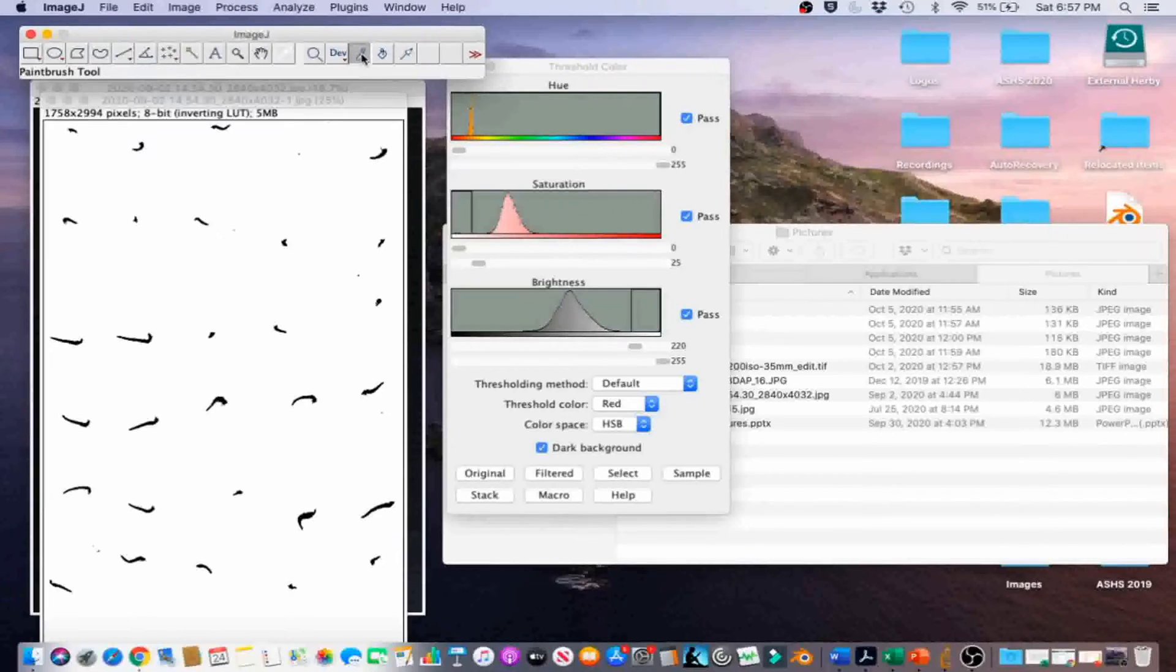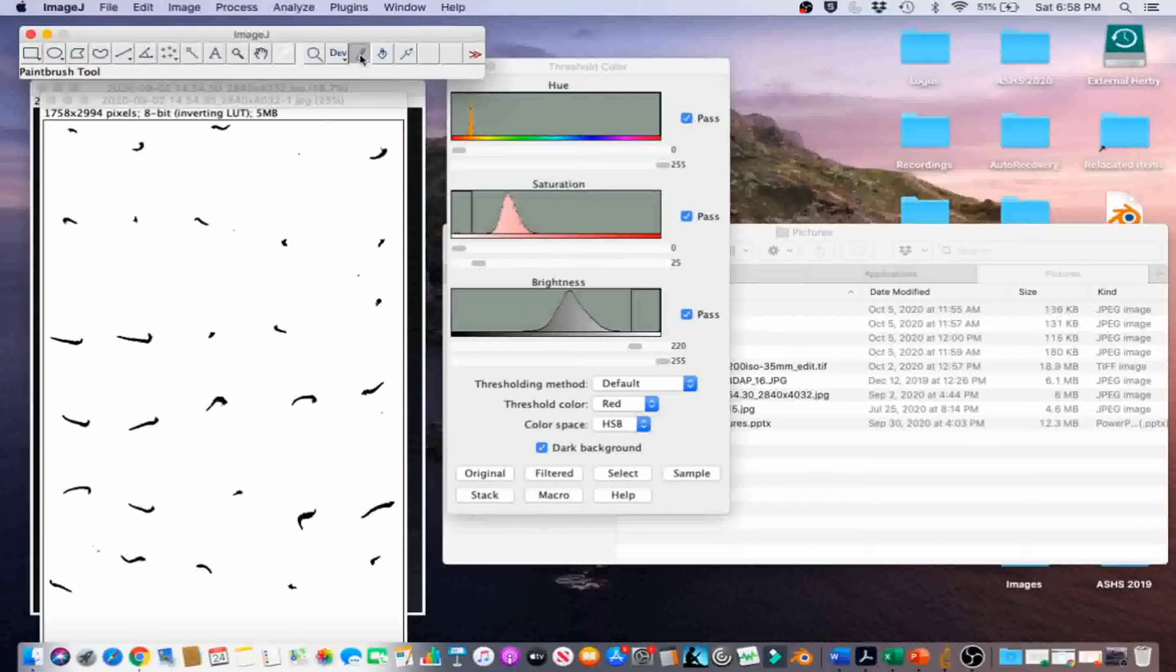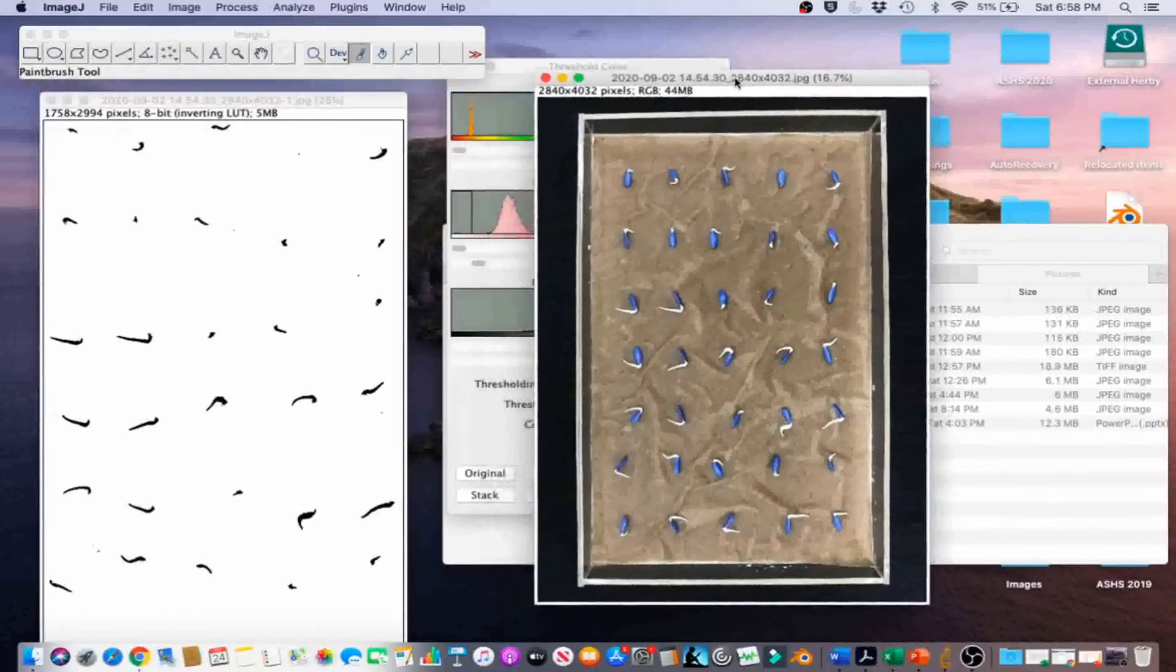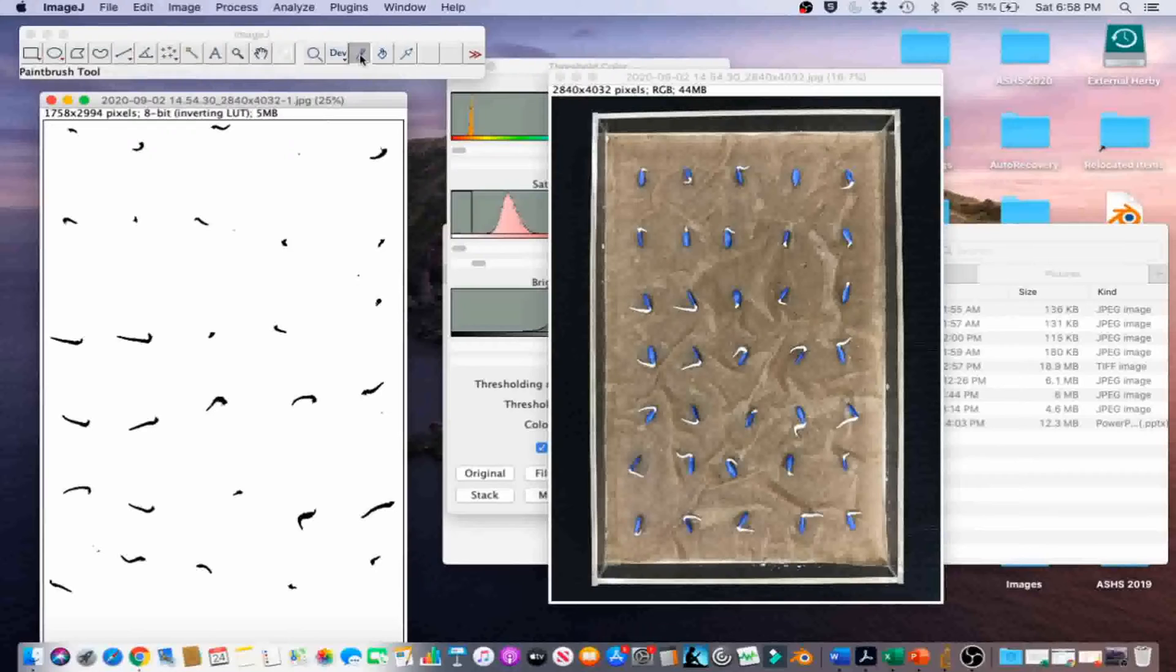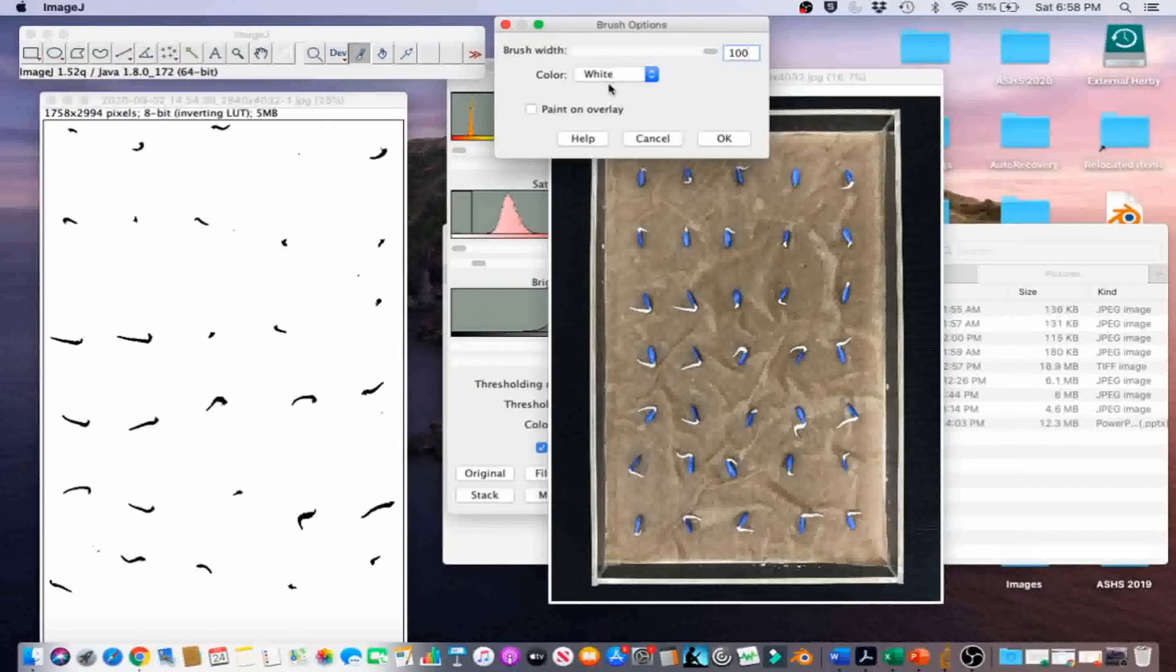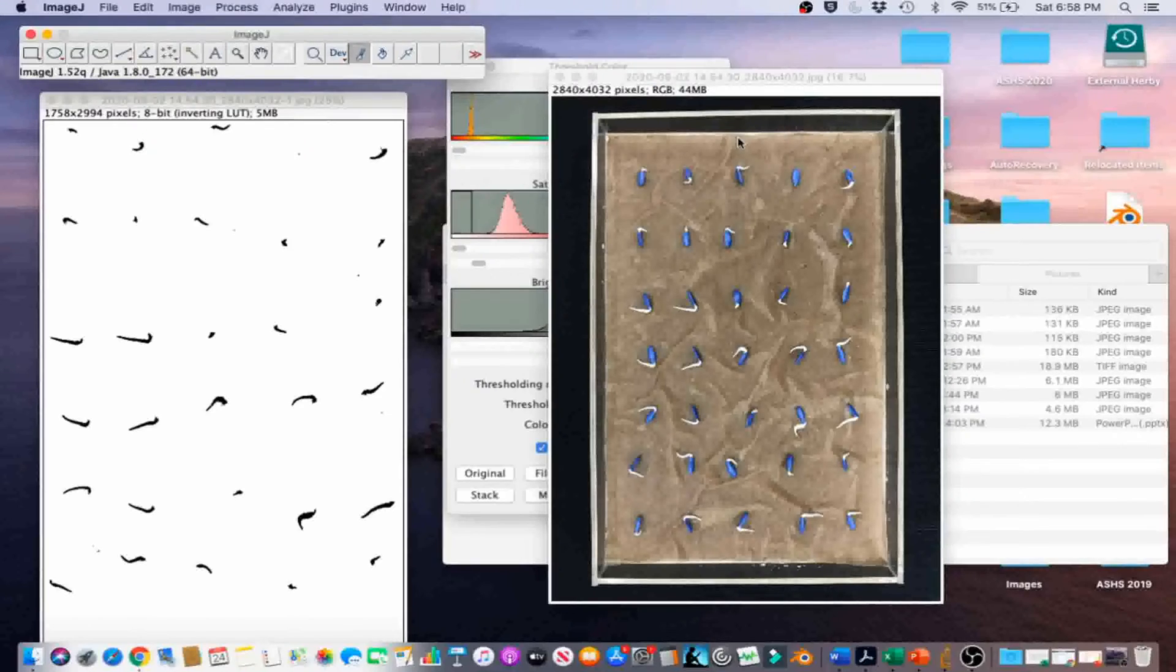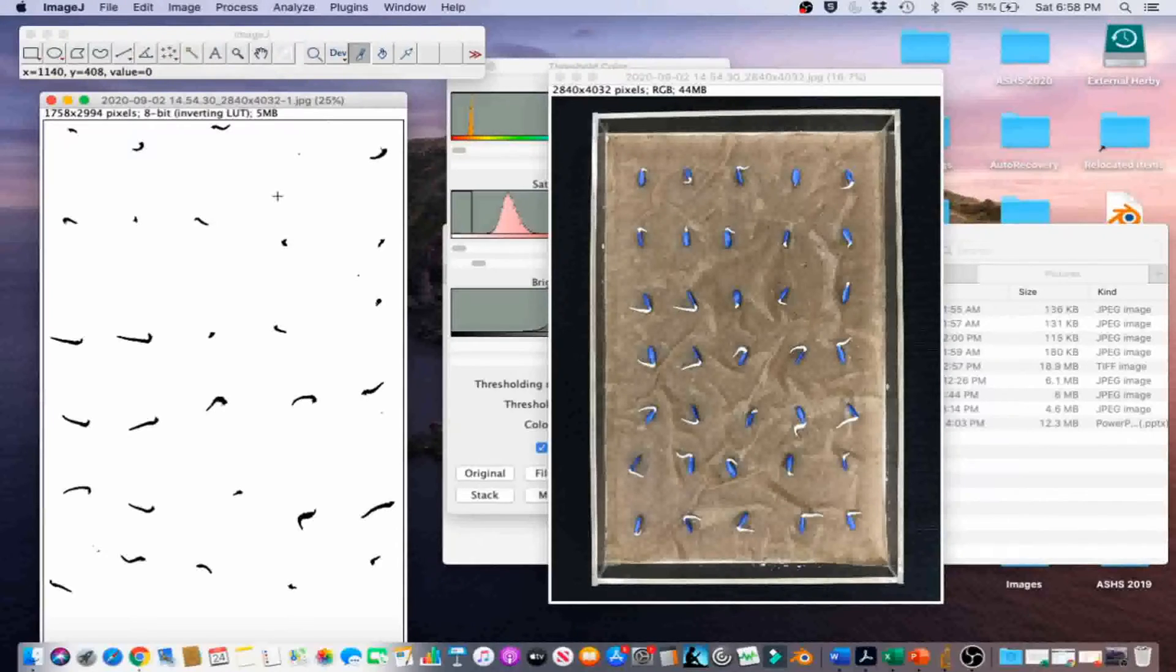Use the Paintbrush tool to remove large clusters of pixels that are not seedling radicals. This step is easiest when comparing the binary image to the original. Go ahead and open that up again. Go ahead and double-click the Paintbrush tool. Fill in 100 brush width, white for the color, and make sure the Paint on Overlay box is unchecked. Then click on OK. Go ahead and erase the pixel clusters that are not emerged radicals.